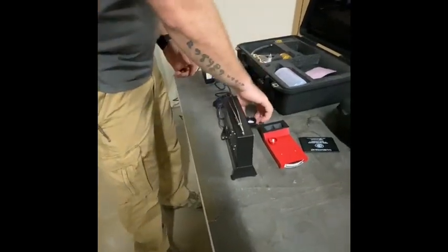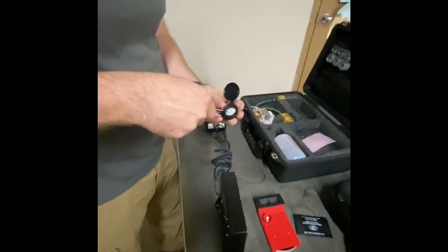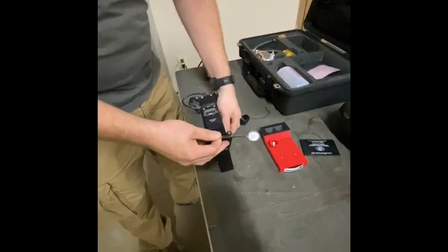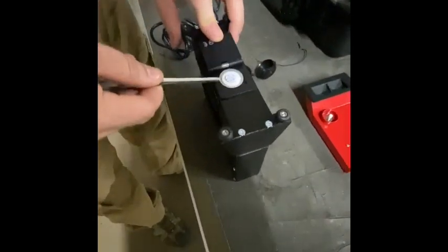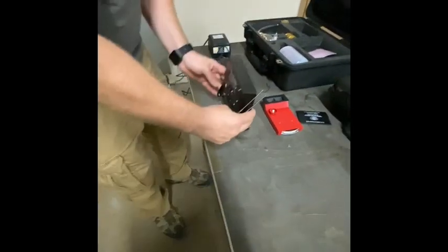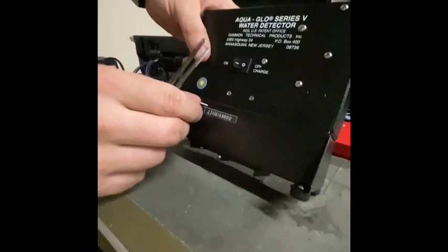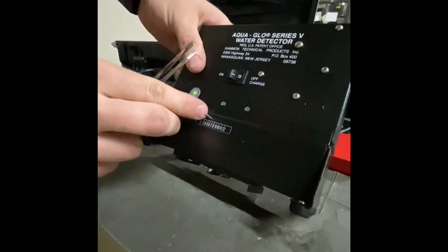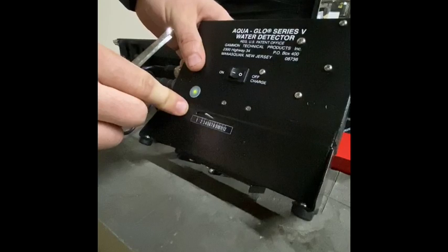So when you're going to calibrate, you take this pad, tweezers, you place it in the bottom of the machine, numbers facing up. Now this dial here, remember this number was 5.7, so what you do is you take this dial and you run it to about 5.7 on these numbers.